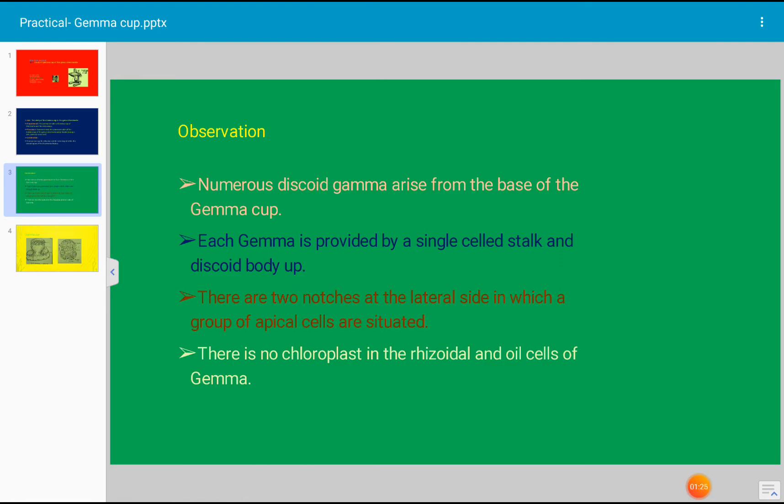Each gemma is provided by a single cell stalk-like structure - that is stalk - and discoid body up. This type of gemma is present, and many gemma are present in each gemma cup.